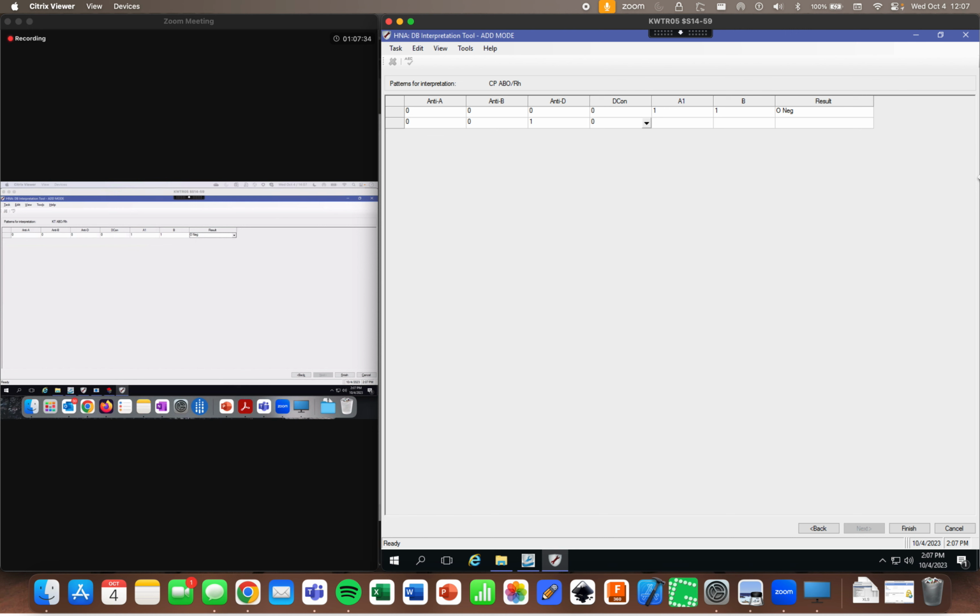How in the world do I get another row? Because I just have this button, I have a finish button, I don't have an add button. Well, yet another one of the things here where the tool is just ancient. Right, so instead of it giving us a separate button to move on to the next line, we're going to do it old school. And once you get to the end of the row, you just hit enter again. And there we go. There's our next row. So reach the end of the row, hit enter again, and that's it.